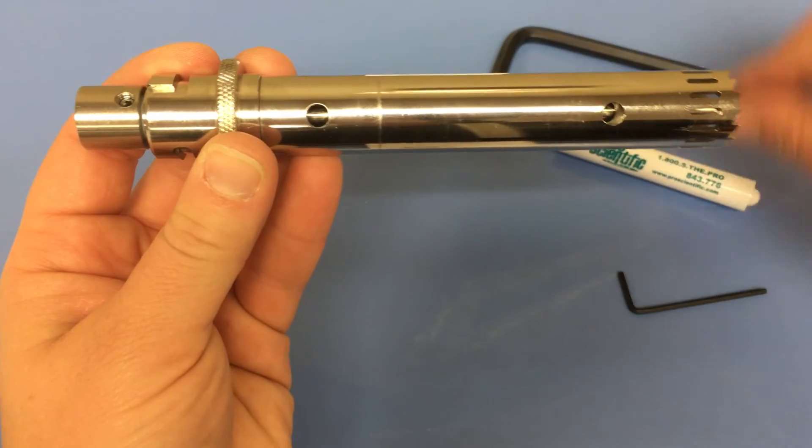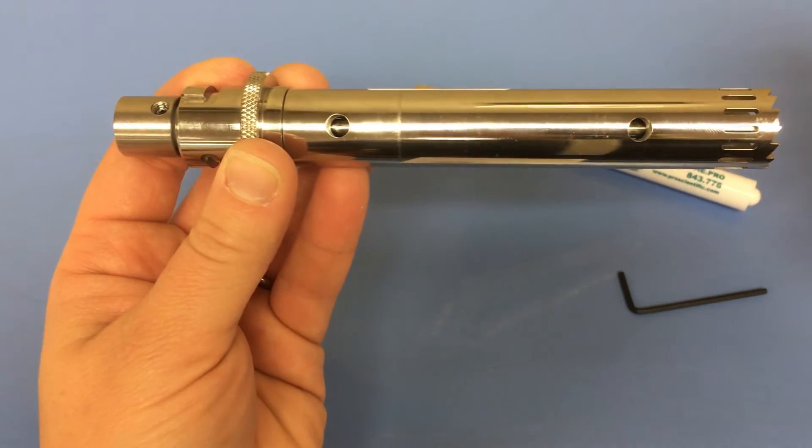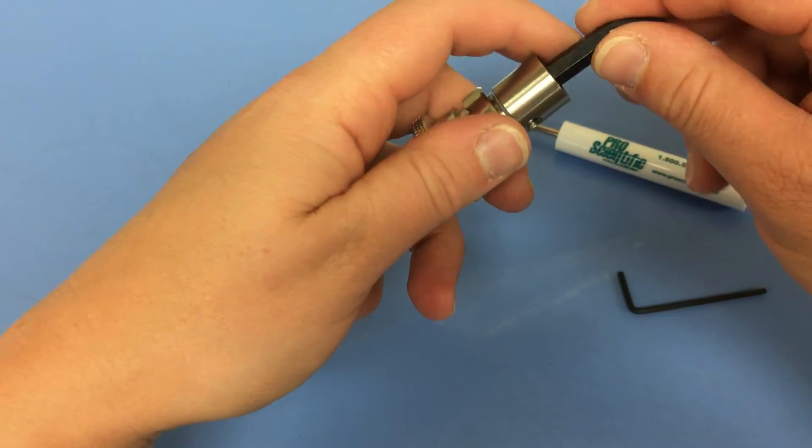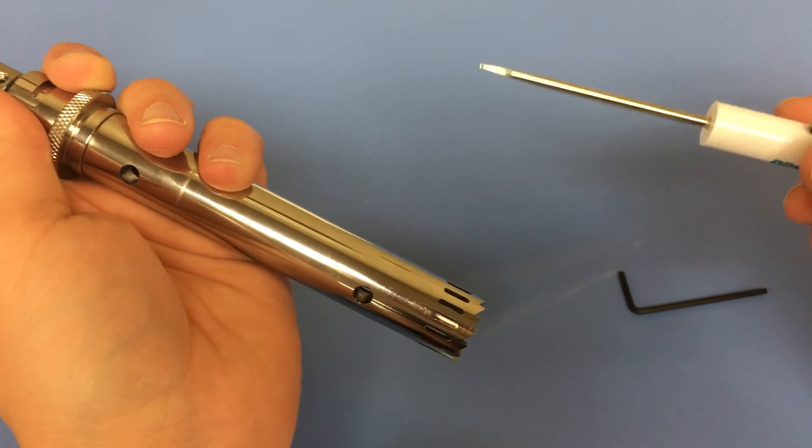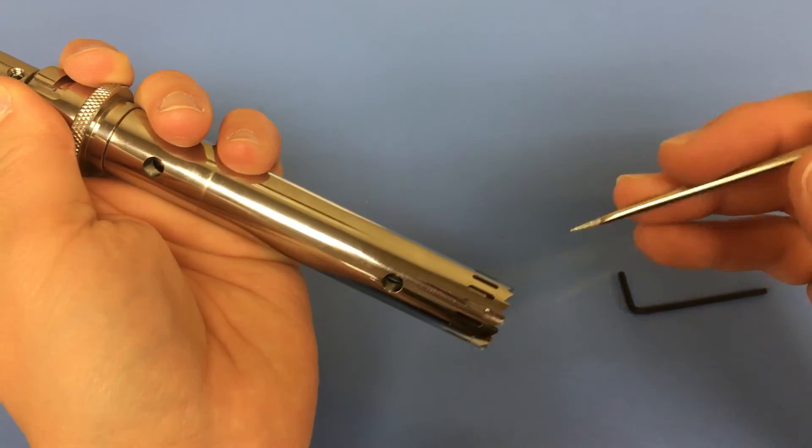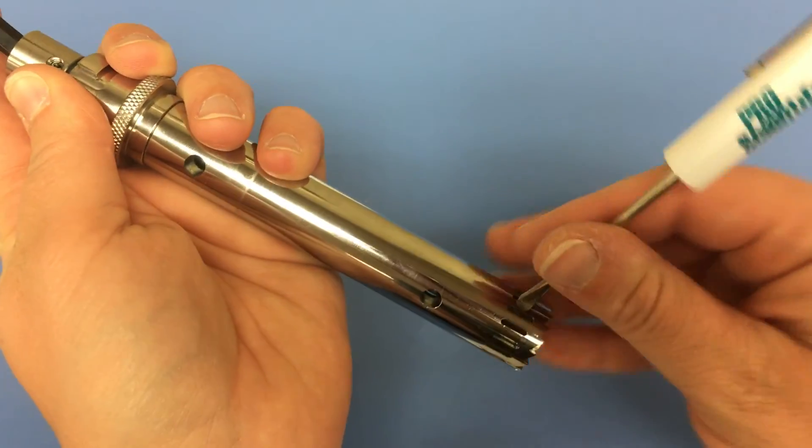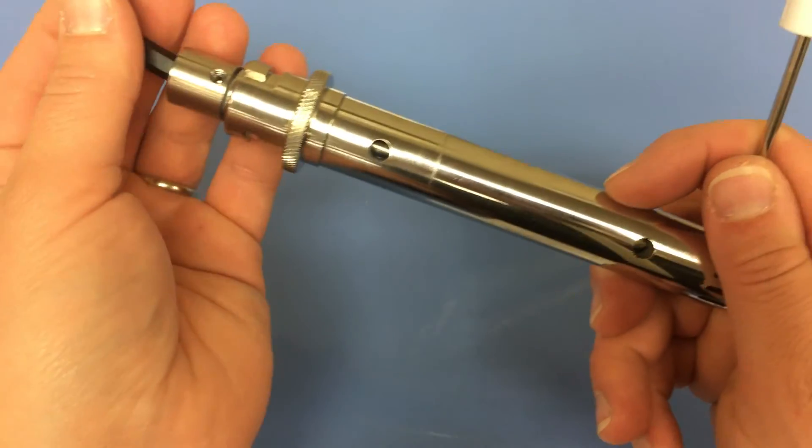Insert the quarter inch hex key into the end of the rotor shaft collar and insert the screwdriver end into the rotor knife. Turn the hex wrench clockwise to confirm it's tight.